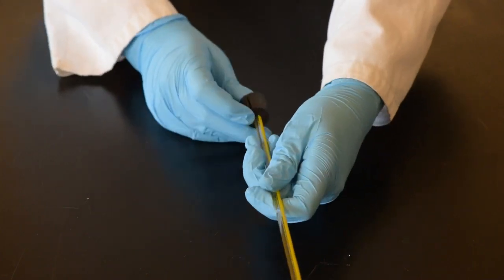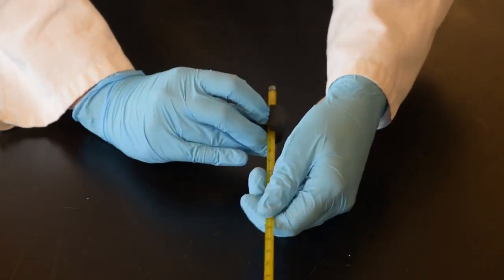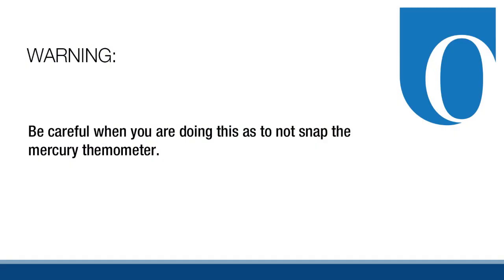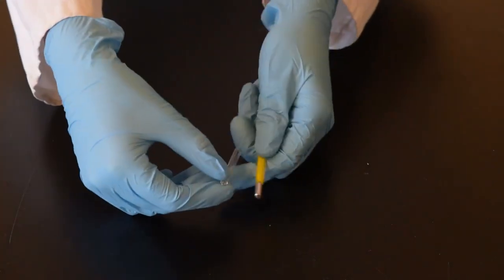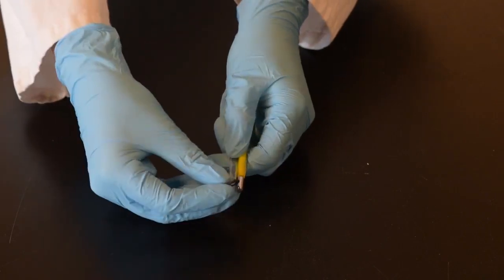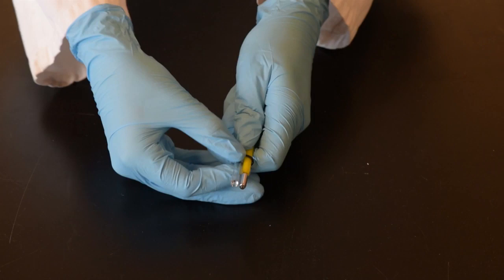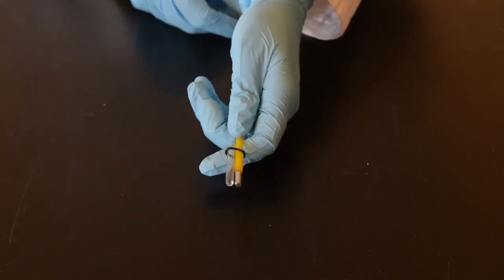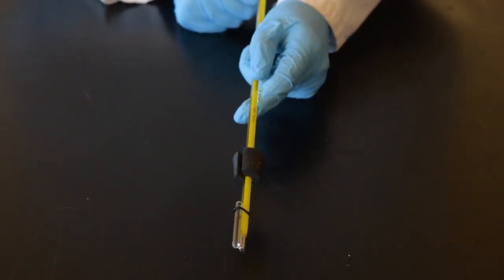To set up your apparatus, first take your thermometer and your rubber stopper and put the rubber stopper onto the thermometer. Be careful when you're doing this so as not to snap the mercury thermometer. Once it's on there, take your small test tube and your rubber O-ring. Line the bottom of the two up and connect them with the O-ring. Line the O-ring up close to the top. Now the test tube is in line with the bottom of the thermometer.